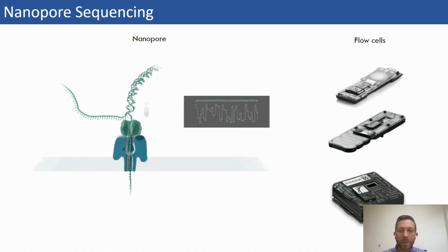Now, nanopore sequencing is read length agnostic, meaning any size of DNA that we introduce into this nanopore can be sequenced. Now, short read sequencing technologies, the sequencing technologies that are used by Rady's and Baylor, can only sequence about 150 base pair fragments of DNA, so very short fragments of DNA. And when we think about the entire human genome, which is 6 billion nucleotides or 6 billion base pairs, sequencing at 150 base pair units is very small.